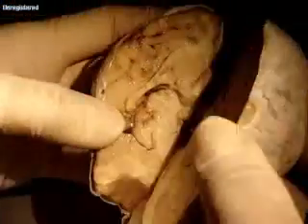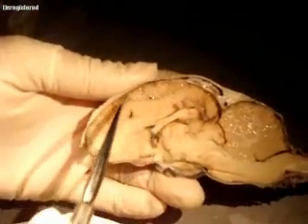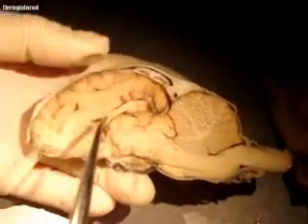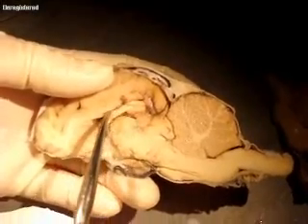So I'm going to open it up. Ta-da! Yay! Okay. Let's see if we can see it. So this part of the brain is the cerebrum, and this would be the cortex of the brain also, so cerebrum. You have a very large tract that goes from right to left.